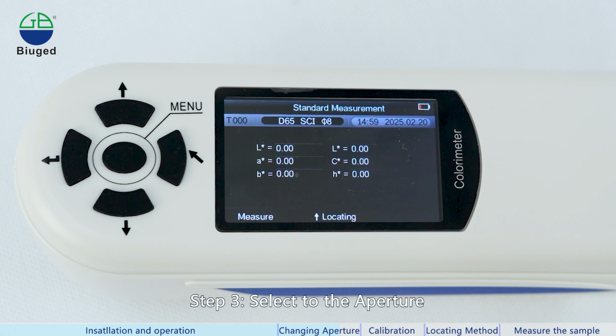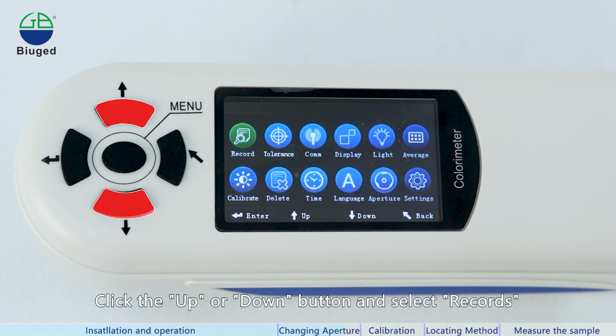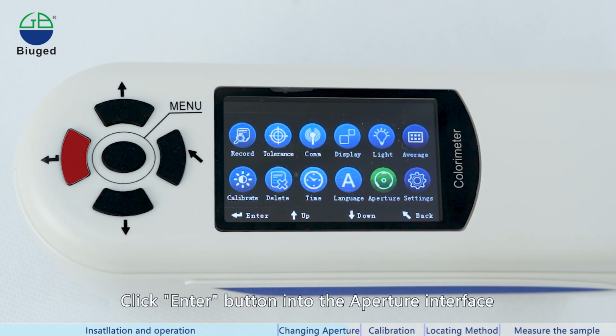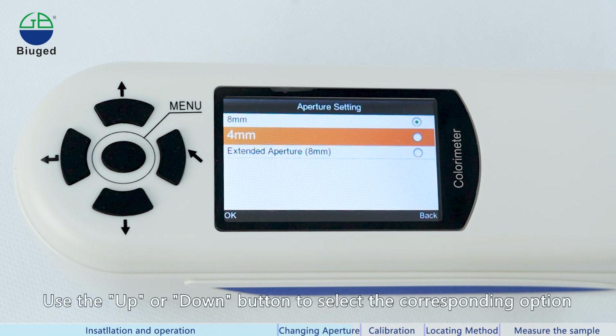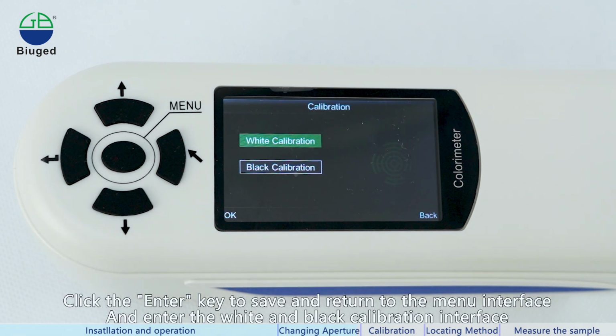Step 3. Select the aperture. Click the menu button to bring up the menu interface. Click the up or down button and select Records. Click the Enter button to enter the aperture interface. Use the up or down button to select the corresponding option. Click the Enter key to save and return to the menu interface, and enter the white and black calibration interface.